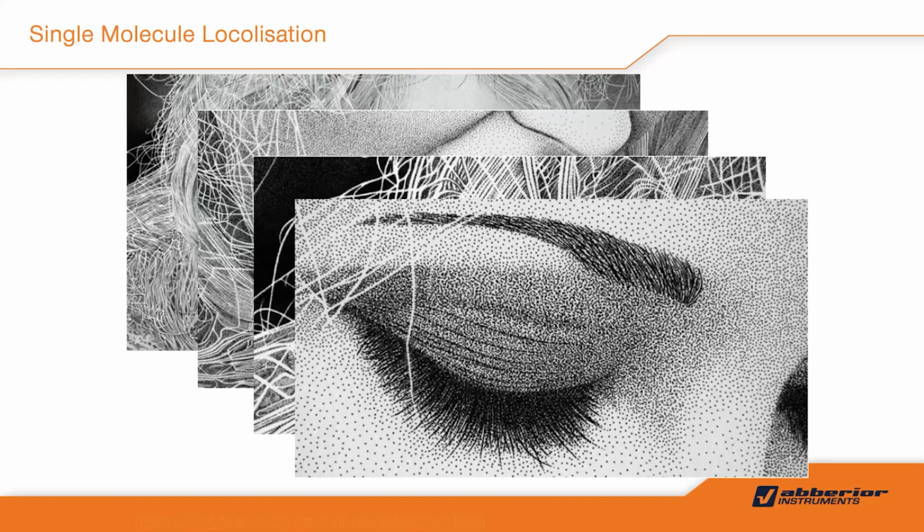The raw data is a lot of coordinates of the dot, and then you reconstruct them into one picture. However, STORM or PALM use a camera-based method, and it takes half an hour to collect thousands of frames with all the random dots, right?